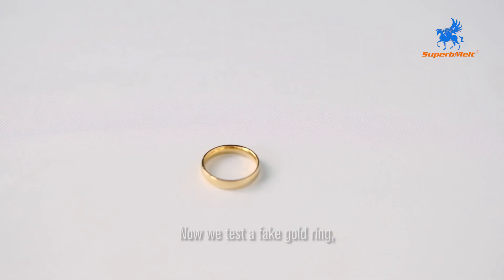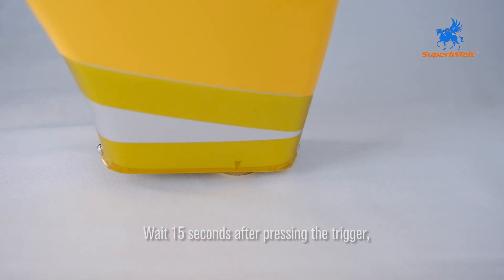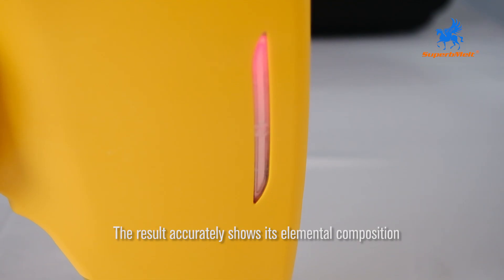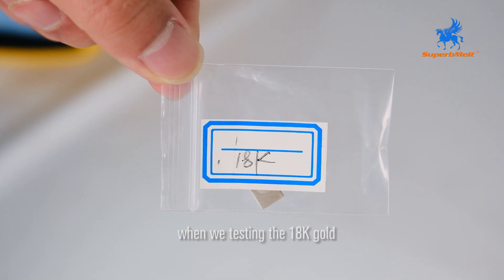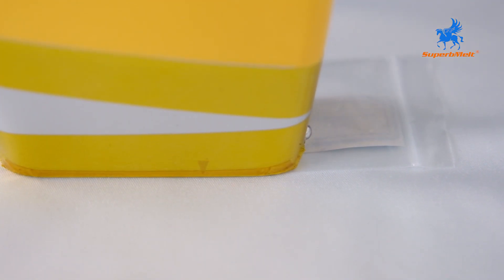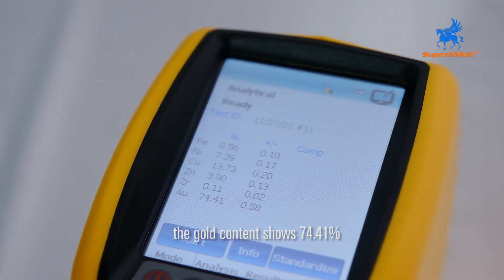Now we test a fake gold ring. Wait 15 seconds after pressing the trigger — the result accurately shows its elemental composition. When we tested 18k gold, the gold content is shown as 74.41%.